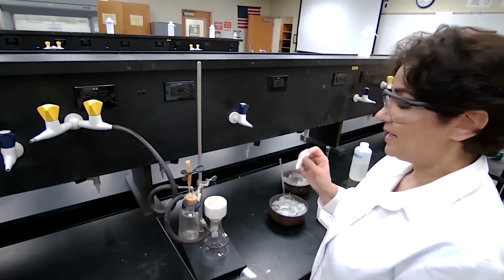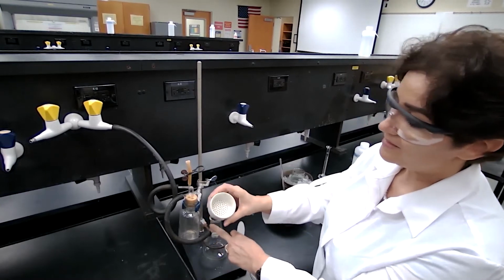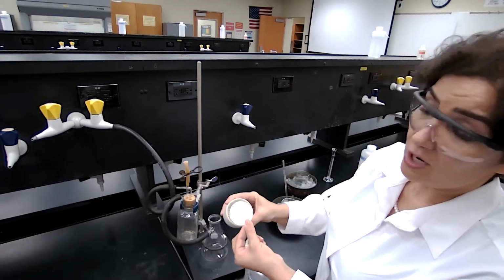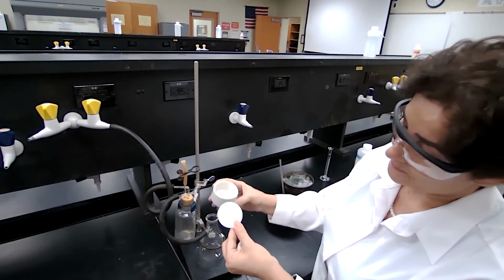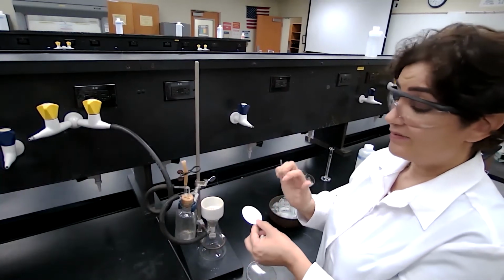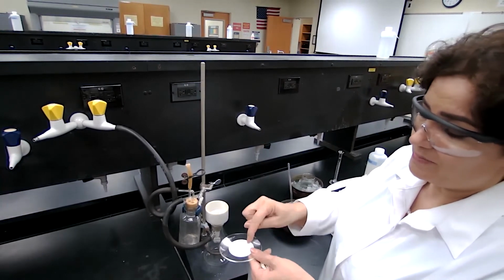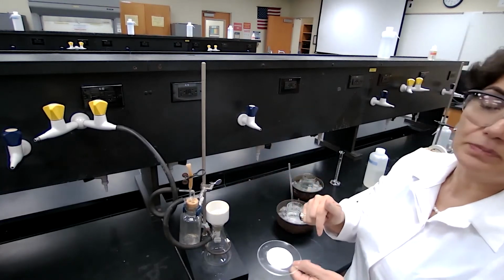I'm going to filter my sample using a filter paper because the Buchner funnel has large openings, so I cannot filter the sample directly on it. I'm going to use a properly cut filter paper that covers all of these openings. Since I'm going to collect the sample on this paper, then dry it and weigh it, I need the mass of the filter paper. And since I'm going to keep it on the watch glass, I'll get the mass of the watch glass combined with the filter paper, and then put the sample on it later.